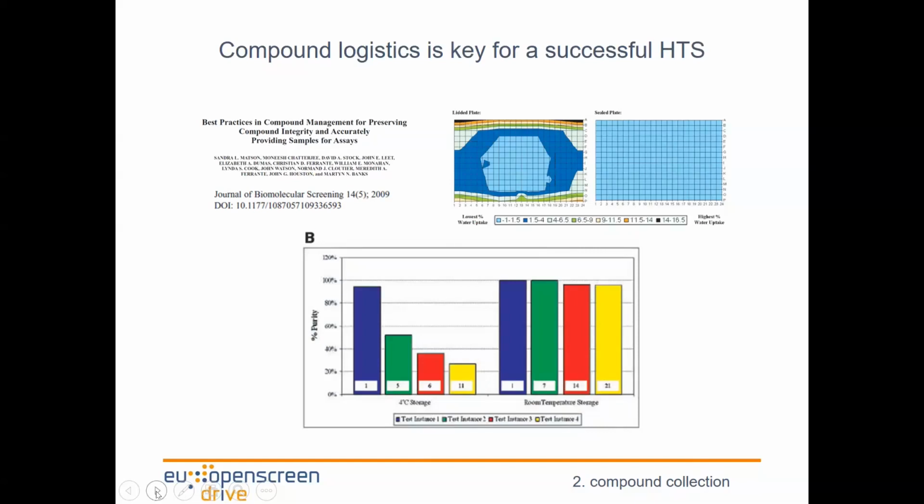So this is critical, because when you are finding some results there, you are not finding results on your compounds, you are finding results on your impurities. So it's better to keep the compounds even at room temperature storage, as on the right, but under inert conditions, as an example, a nitrogen current or some kind of environmental control that avoids this water uptake. So this is just to summarize the relevance of having your proper chemical compound collection, but also managing it in a proper way.